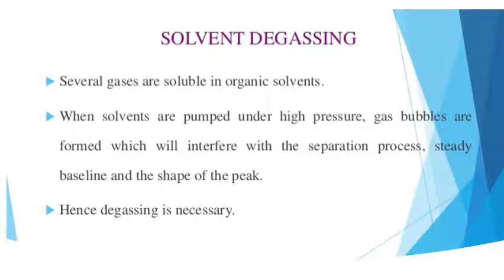The next component after the solvent reservoir is the degasser. The degasser is used to purify the solvent and remove the impurities from it, as several gases are soluble in organic solvents.